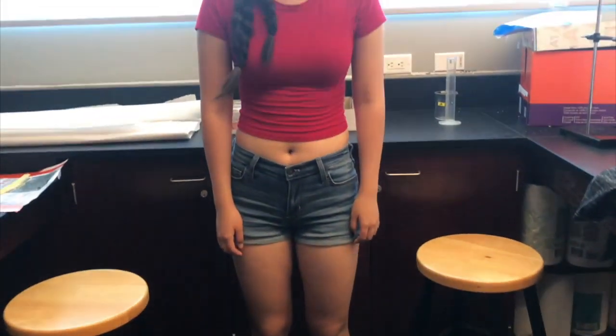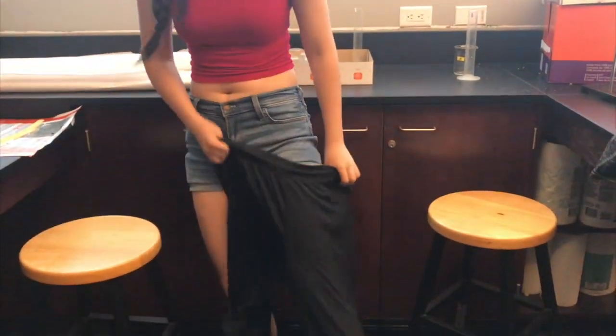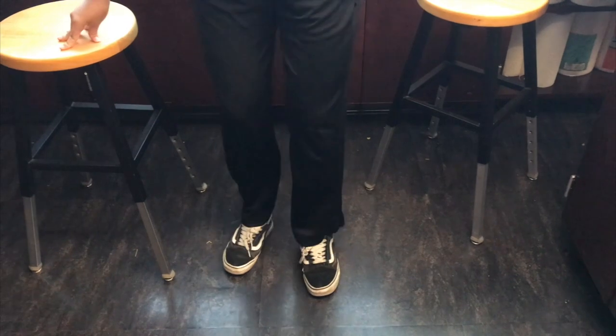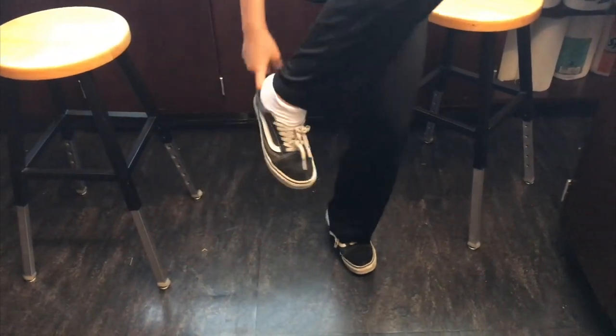Having a strong set of overall laboratory safety rules is essential in avoiding accidents or injuries in the lab. First, you need to wear long pants. Never wear shorts or skirts in the lab. Next, wear closed-toed shoes. Never wear sandals or other open-toed shoes in the lab. Footwear should always cover the foot completely. And don't forget to tie your shoelaces, because you don't want to trip.